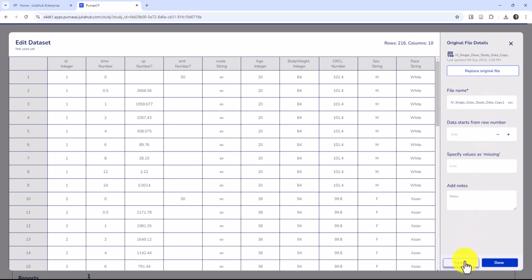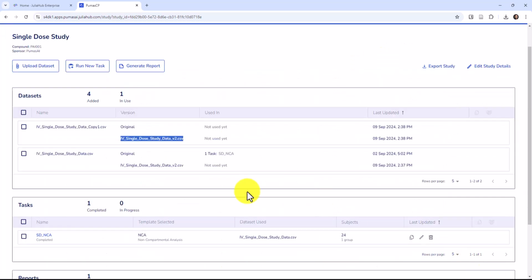When I replace it, as long as the column names are the same, this dataset is automatically updated. So the entire action of copying an original dataset allows you to copy the downstream transformation steps and also results in giving you the derived datasets of the original transformation.